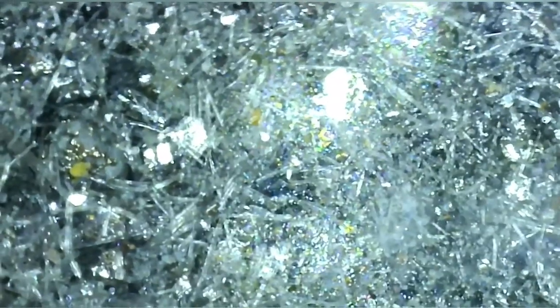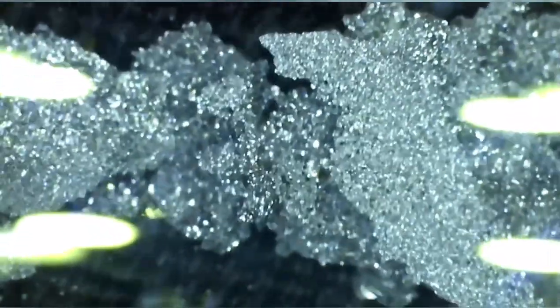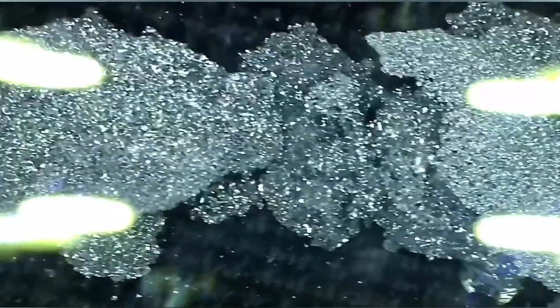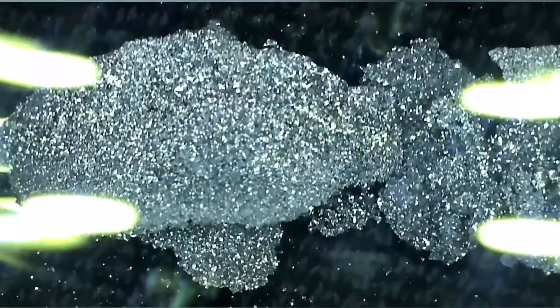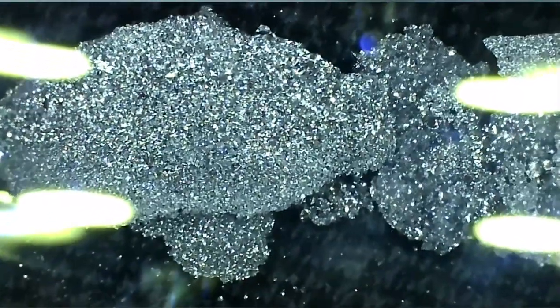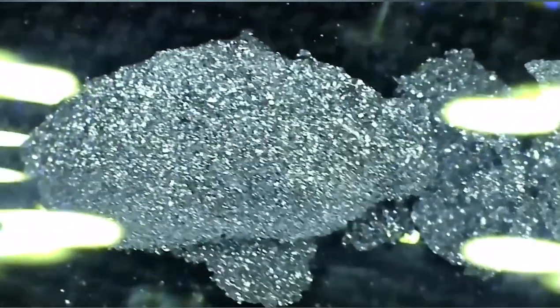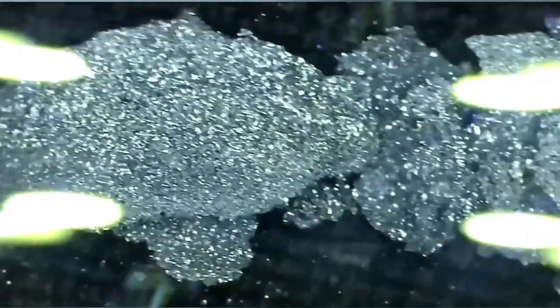Now we are going to take a look at the arsenic under the microscope. This is the arsenic sample contaminated with glass wool. If you look closely you can see many, and I mean many many many, thin hairs of glass. In comparison to that, this is the pure arsenic. With absolutely no silicon dioxide hairs in there, it looks beautiful. It has a silvery shine to it and it looks like some sort of diamond stuff. I hope that it stays this way, because if there was oxygen left in the ampoule, it would corrode over the period of a few days and it would turn somewhat greyish black.